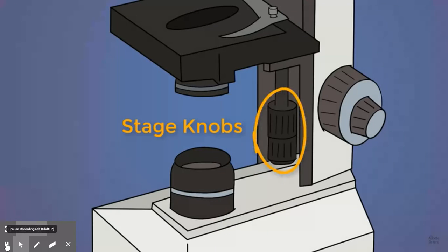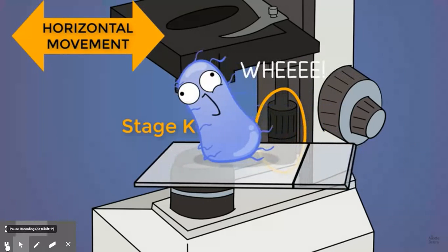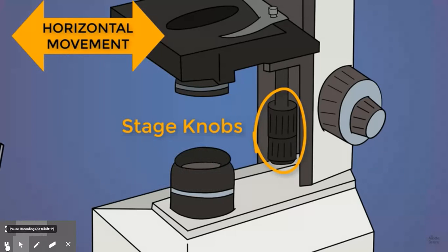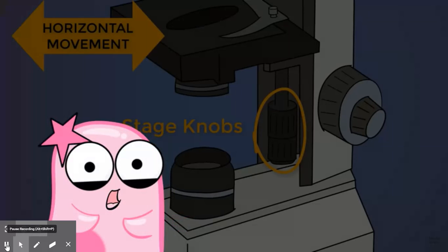These knobs, the stage knobs, don't move the stage up and down, but rather from side to side instead. It helps you explore what's on the slide itself, but it isn't adjusting the focus of it. Not all microscopes have those stage knobs. Sometimes you have to move the slide manually.